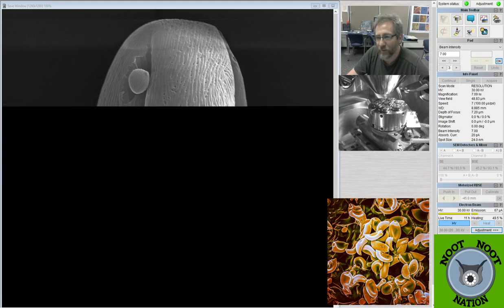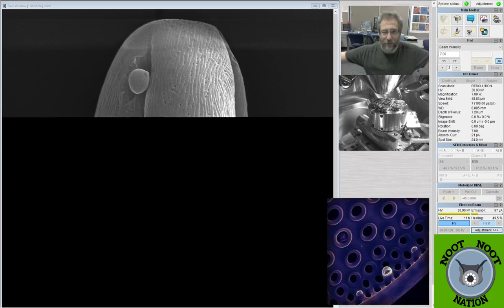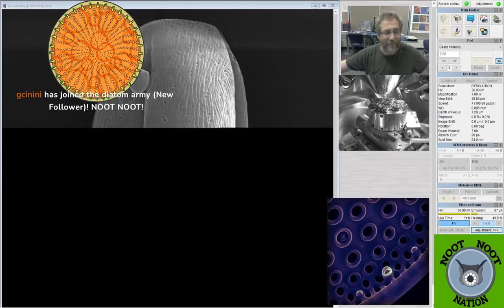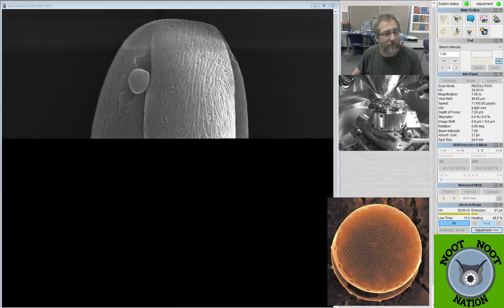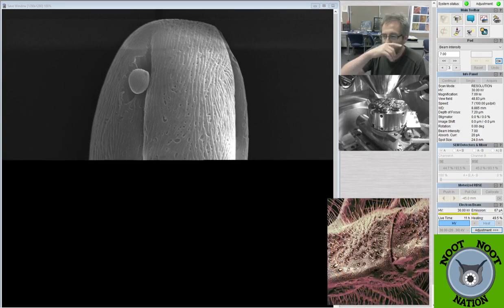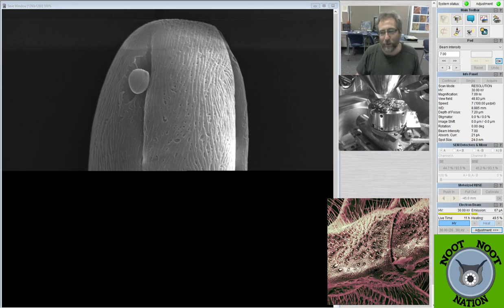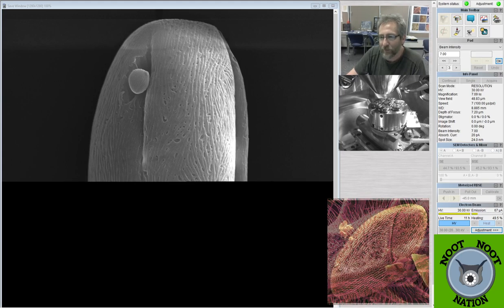Does the surface that the SEM sits on have to be very steady? Sure. The SEM's actually like the size of my desk, so it came with the desk incorporated in it. You don't want a lot of vibrations or movement, because if it vibrates, the image will get messed up. So yes, it does need to be very steady. It's not that hard to get a steady surface if you're just putting it on a cement floor. I have colleagues who were like, how do you have a SEM on a carpeted floor? It works fine in here. Actually, the carpet probably keeps some vibrations low.